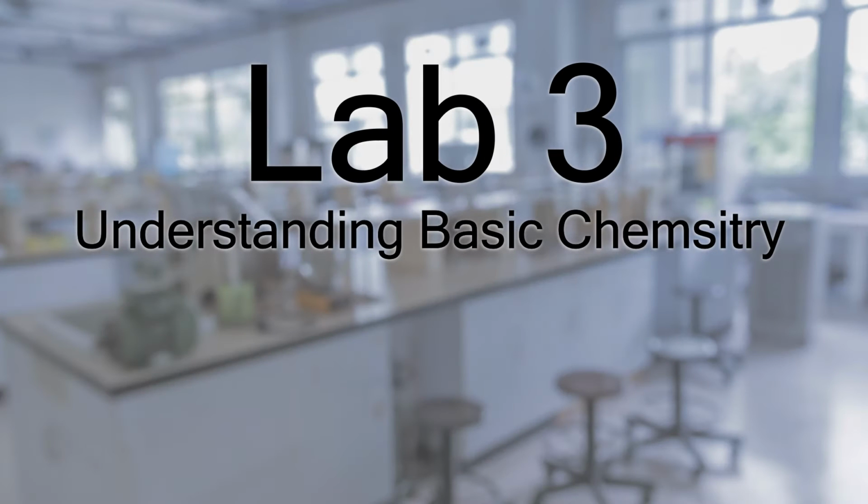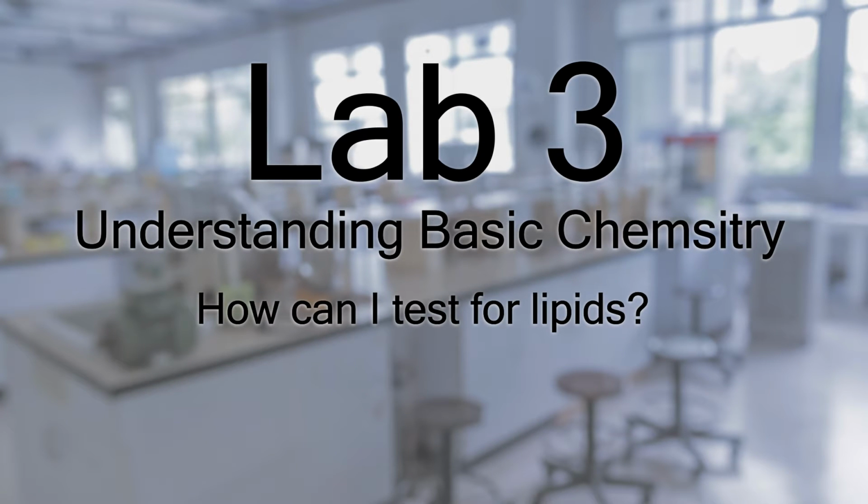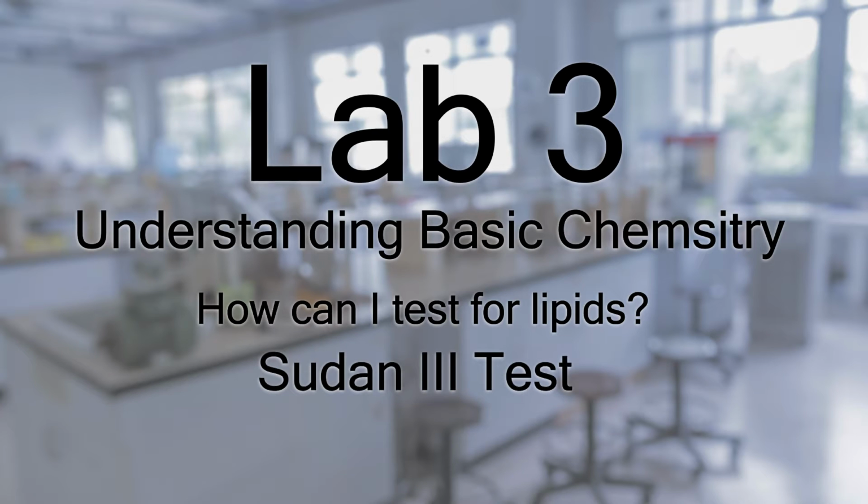Lab 3, Understanding Basic Chemistry. How can I test for the presence of lipids using the Sudan 3 test? In lab, we will be using the Sudan 3 test to test for the presence of lipids in a series of samples.